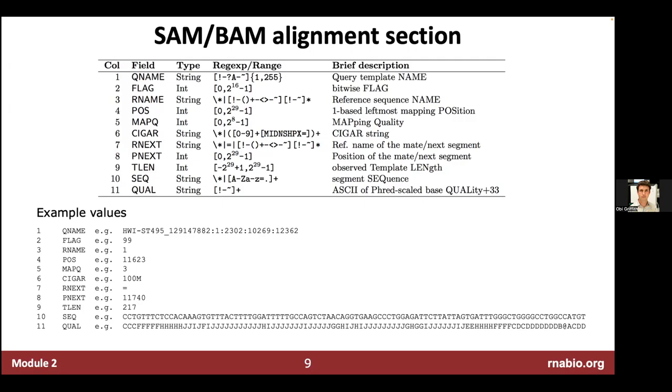We talked about trimming, how it would potentially throw away reads if there's too many bases that are too poor quality. So it's looking at this exact information. It's looking at that string of random letters and symbols and going to that lookup table and doing the math, basically.